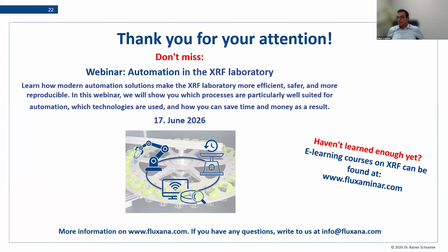If you use calcined samples, then of course the LOI during fusion is always 0, and that means there's no need to enter it. Sometimes you will see programs where you still enter the LOI, but then this is only for calculations you do afterwards. That means you get your result from the calcined sample, and with entering the LOI, you just recalculate to the original sample. But this has nothing to do with the calibration process itself.